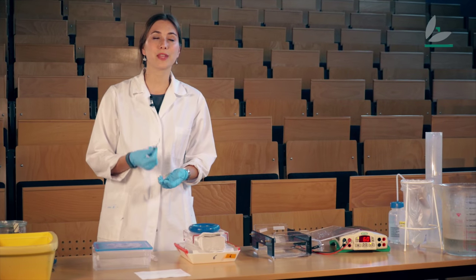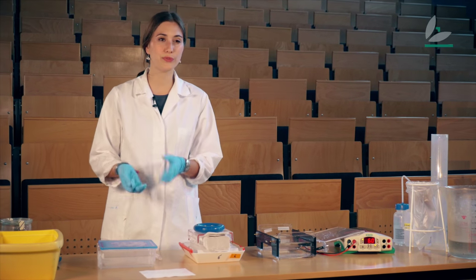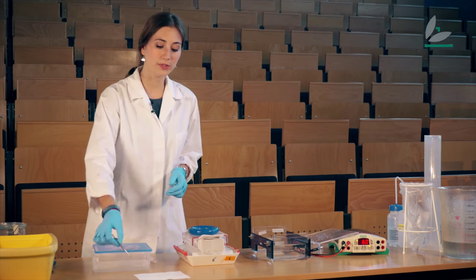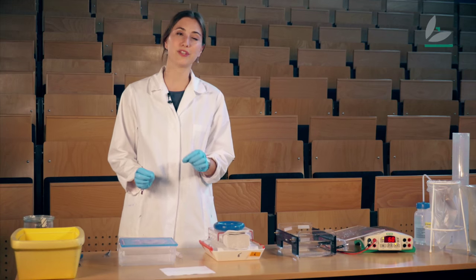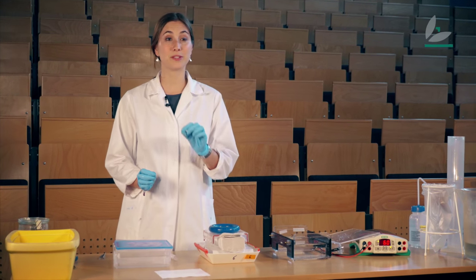In order to see them, I use a trick similar to film development where I'm going to put this membrane in a liquid that contains a special component, what we call the probe. This probe binds very specifically to my gene of interest and it's very easy to be detected.